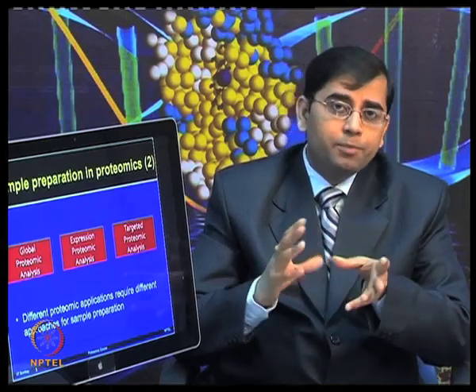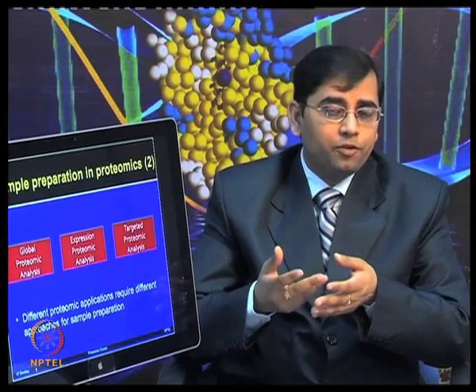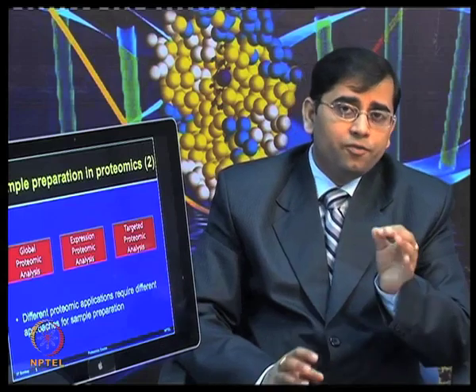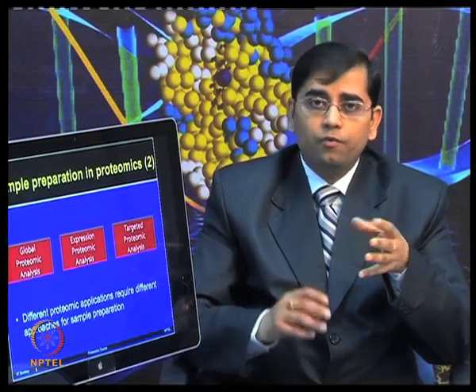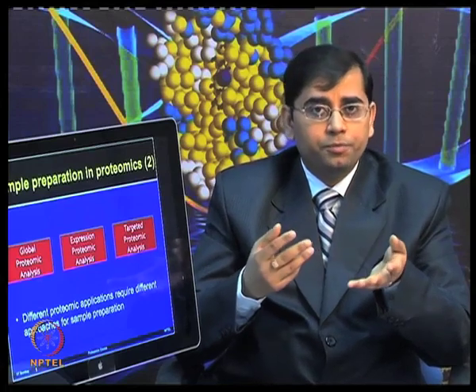The protein expression analysis is most commonly used for various types of clinical studies. Targeted proteomic analysis, if you are very focused on a given organelle or a given sample type, often you would like to know what is happening in that particular proteome, for example, the mitochondrial proteome.